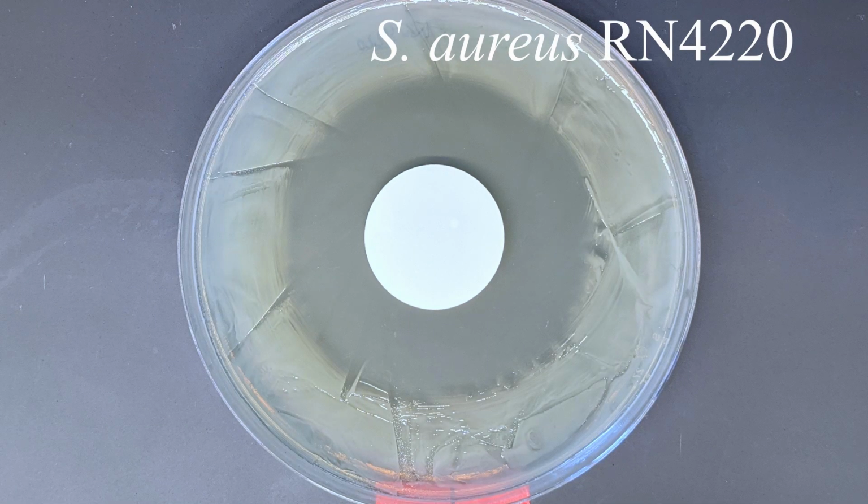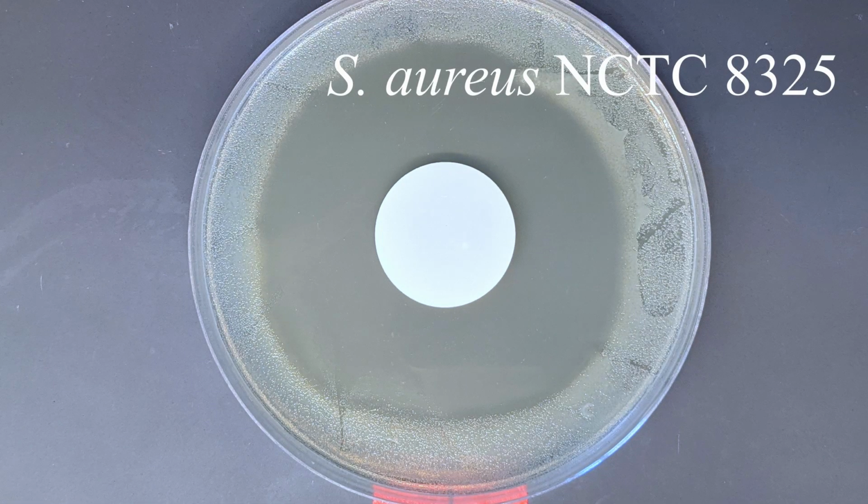Next morning, we see that the placebo has no inhibition effect. And S. aureus that are too close to the filter with penicillin are unable to grow because the penicillin diffused.